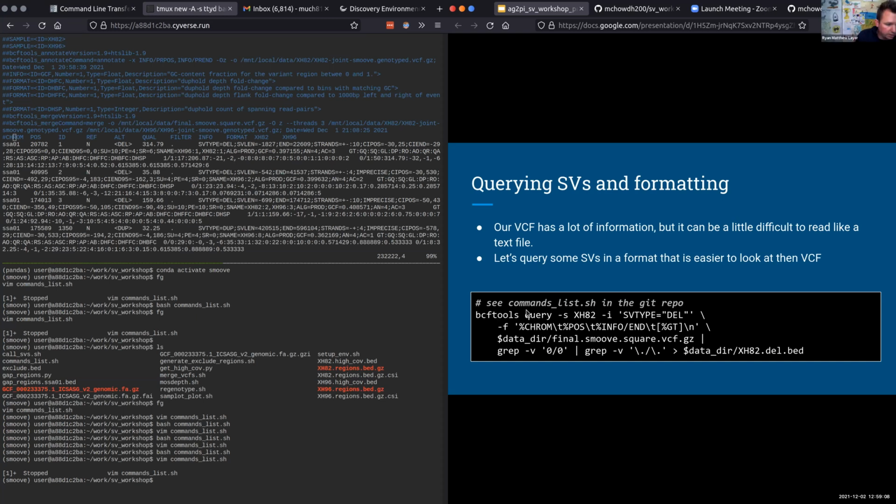Hang on real quick, Murad. So I think it's worth, for people who have not looked at structural variant VCFs, but have looked at SNP VCFs, making a couple of things clear. So one is this reference field and the alternate field.